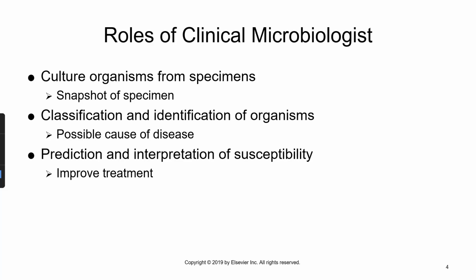So, for example, if we get a cerebral spinal fluid specimen, and we spin it down, so we centrifuge it, and all of the clumpy bacteria stuff goes to the bottom of the tube. We can then take a sample of the bacteria that fell to the bottom of the tube, put it on a slide, and gram stain it directly, and we can start to evaluate what cells were found in that sample. If we see certain types of cells, then we can give clues to the doctor as to what could be causing the infection.